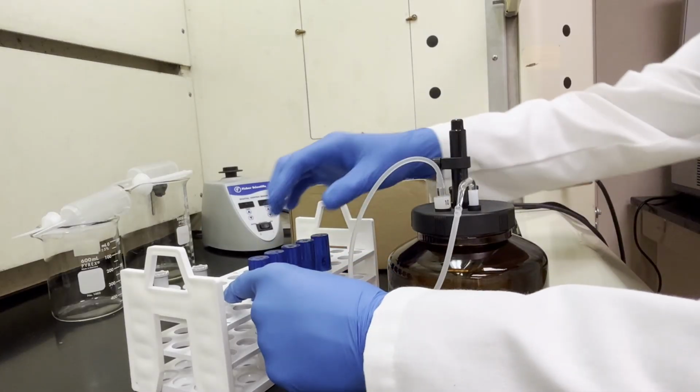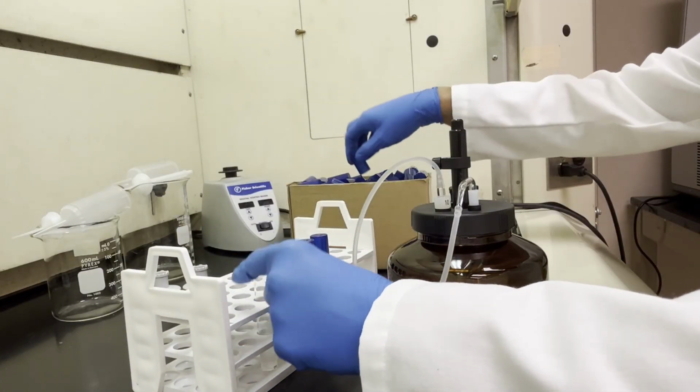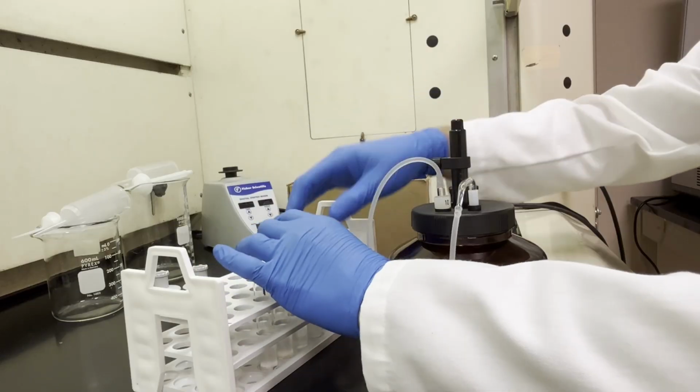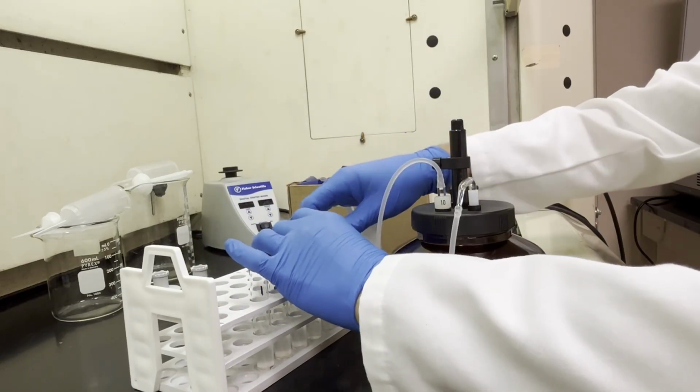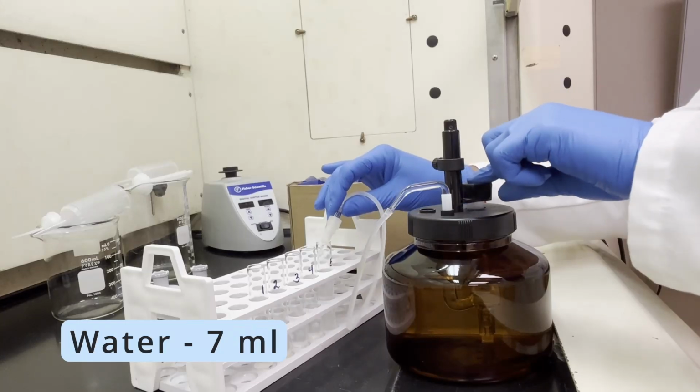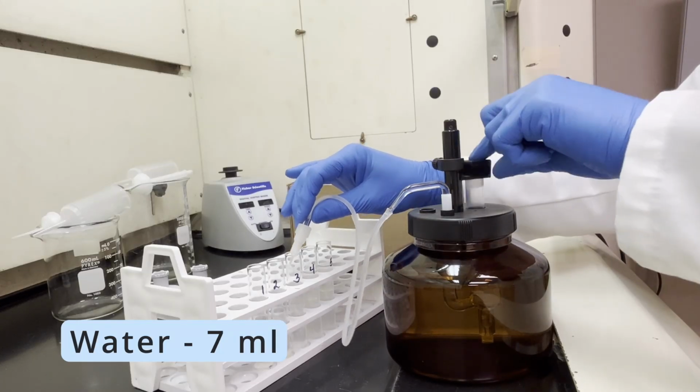After the reaction is complete, the caps are removed from the tubes and water is added to each. This will allow 2 layers to form: a top layer of heptane containing FAMEs and a bottom layer containing water and the residual seed material.